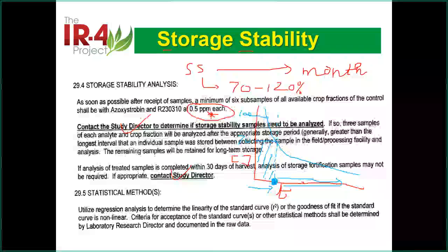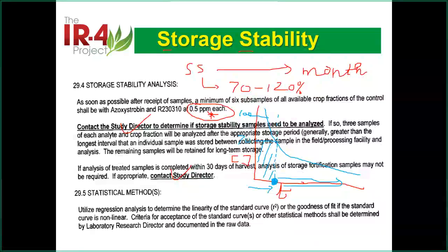Yes, in the calculation, you put both of them individually, but when you do the report, tomorrow we'll talk about report, we will report only the averaged number, or the number you know is correct. For example, if you made a mistake on something, you can tell. Okay, yes. The correct answer is yes, you use the average number.